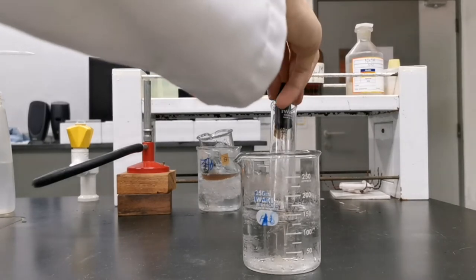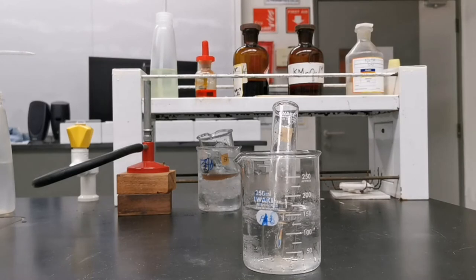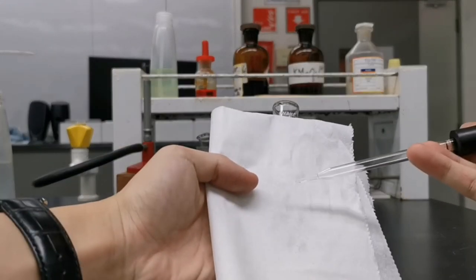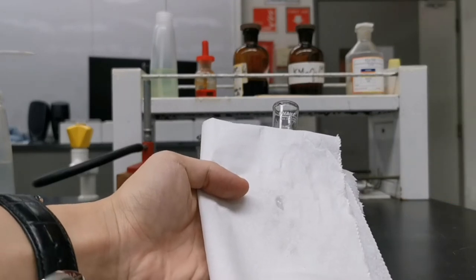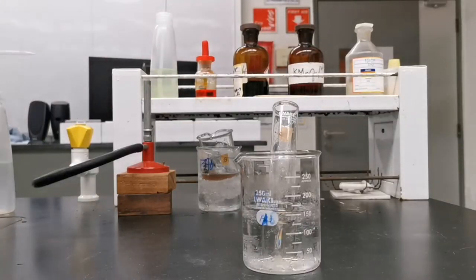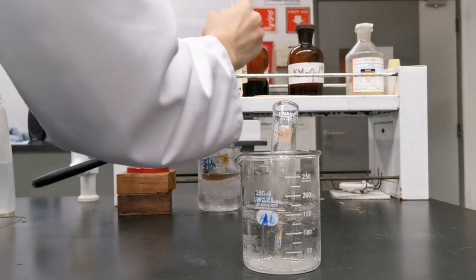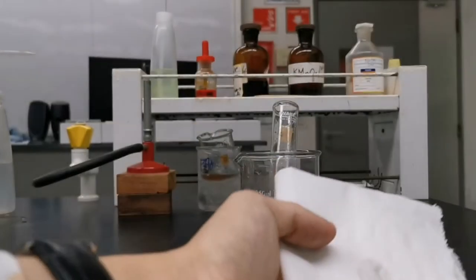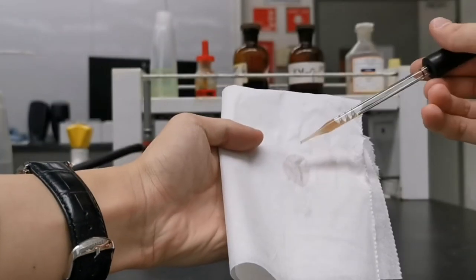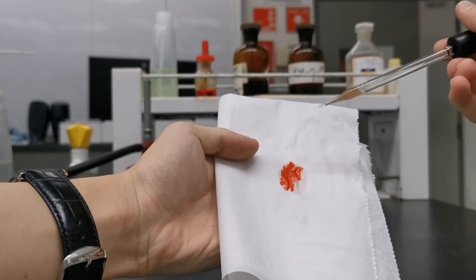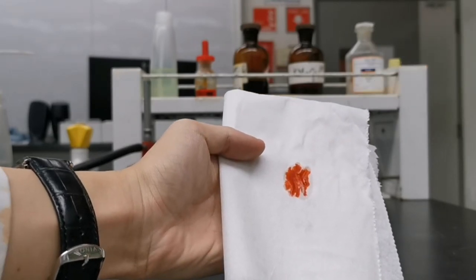To do this I use a tissue paper, add a drop of the diazonium ion solution onto it, and then proceed by adding a drop of naphthol onto it. A bright red color is seen which is very fascinating.